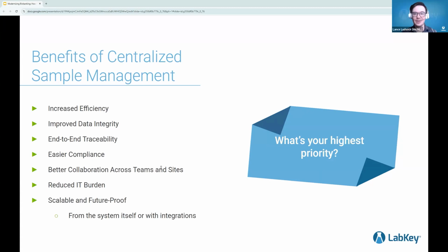So when looking at those vendors, always ask, how do they help with that software maintenance? Do they do upgrades for you? Do they support and make sure that the system stays online? How do they do that maintenance? Ask them, does it take a couple minutes, hours, days?